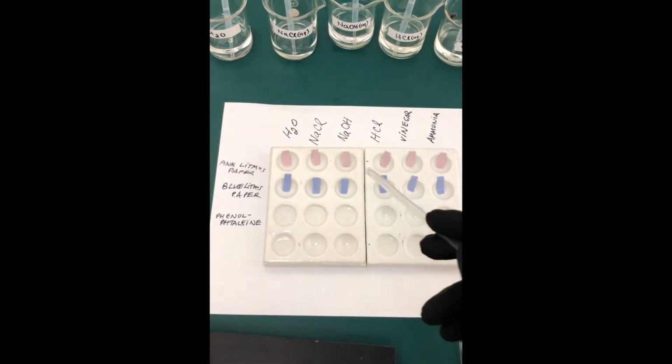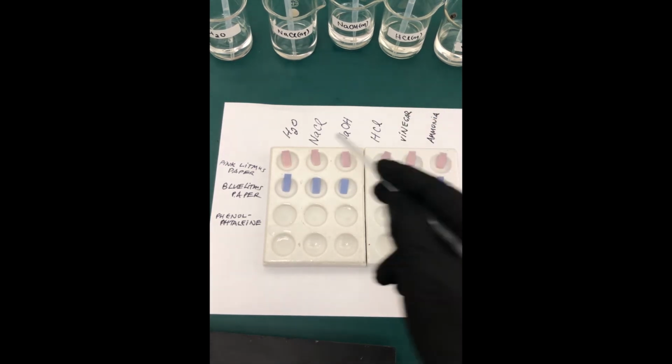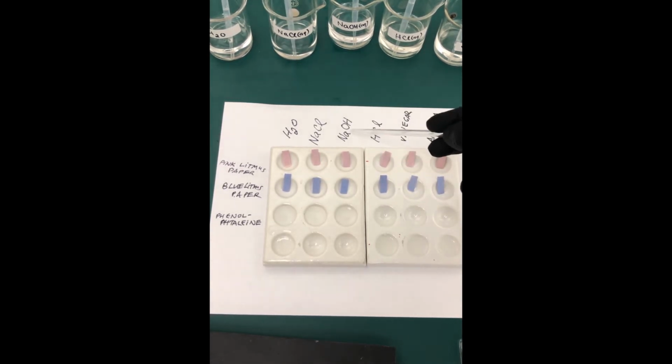Okay, students, what we have here is a set of ceramic plates with wells in them, and we're going to use them to test the 6 items that we tested for conductivity in the previous example. So we have water, sodium chloride solution, sodium hydroxide, HCl, vinegar, and ammonia, all of them dissolved in water. We're going to do 3 tests.